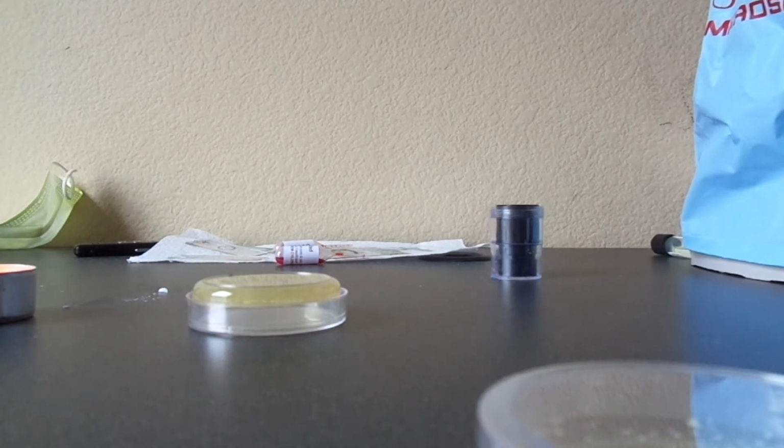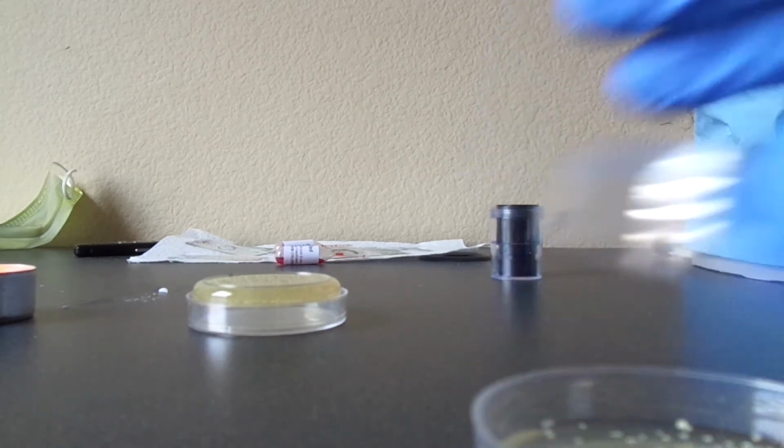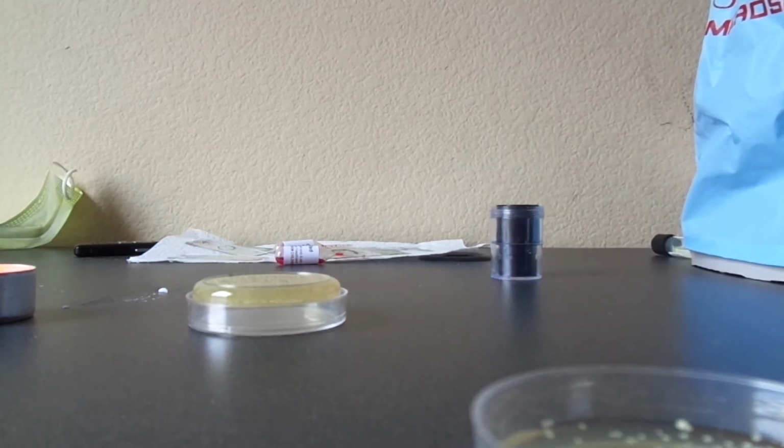Alright, so I'm going to open this. Take a couple of the colonies.